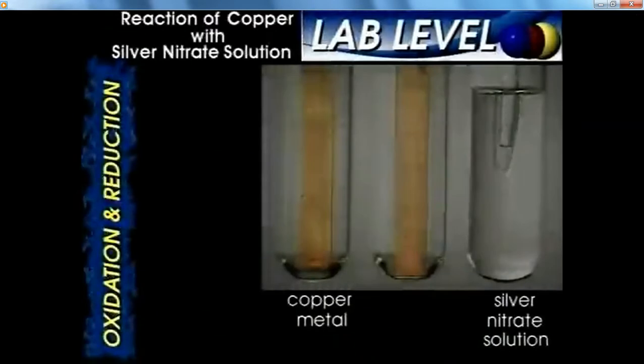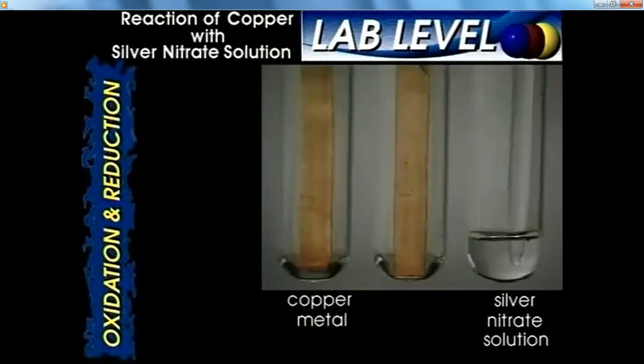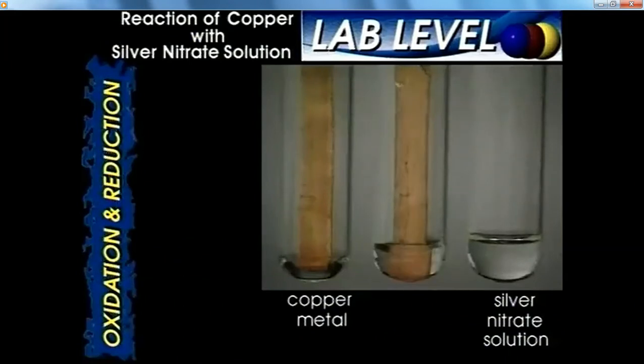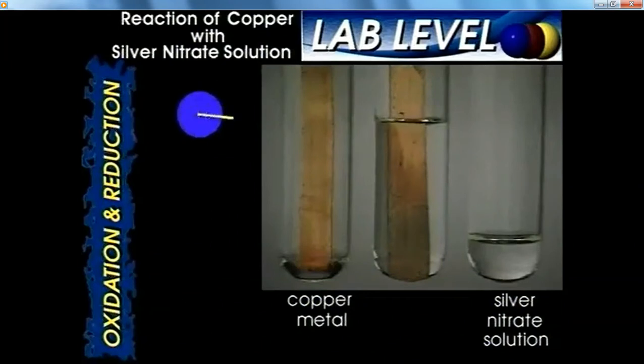The reaction between metallic copper and silver nitrate solution is slow but dramatic. With the benefit of time-lapse photography, you should be able to make at least 3 observations. Firstly, solid appears to deposit on the surface of the copper and fall off when it becomes too heavy.